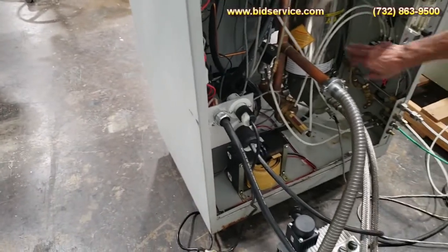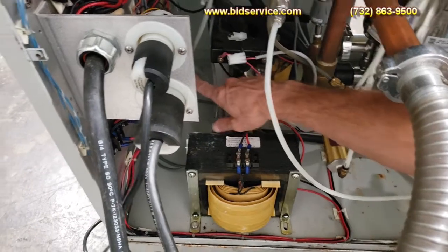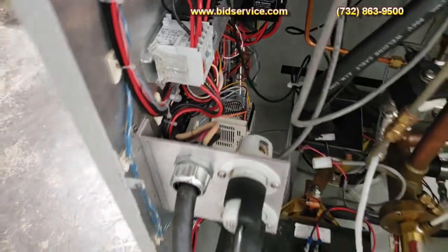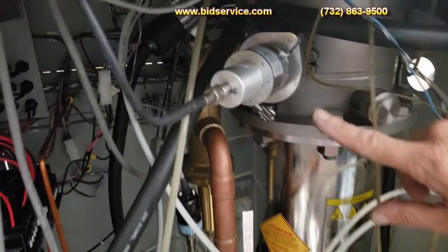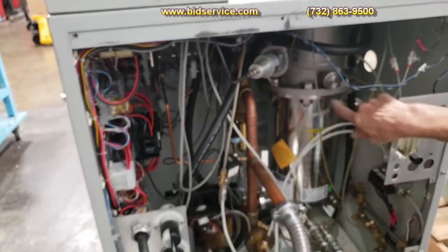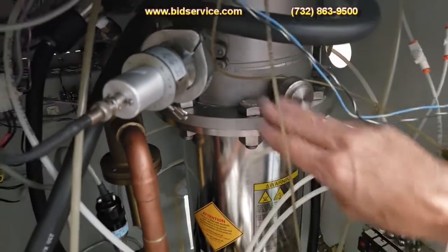Back here you can see the cryo pump and one of the high current sources, with another one up front. There's a PLC back in here that runs the auto vacuum and auto vent, which I'll demonstrate. This only has one cold cathode gauge — a Varian IMG-100 — required for the controller up front. You can install another one in the IG tube port, but it's flanked off right now. This is on the other side of the high-vac valve.